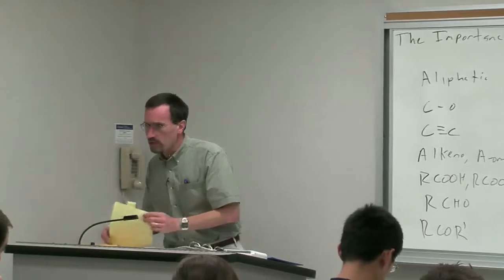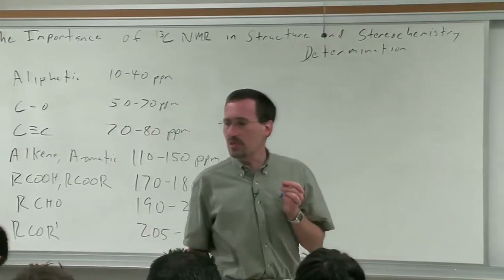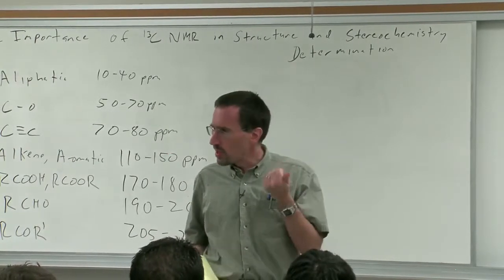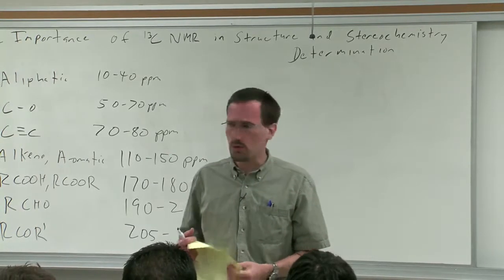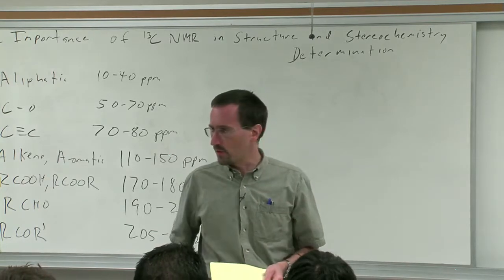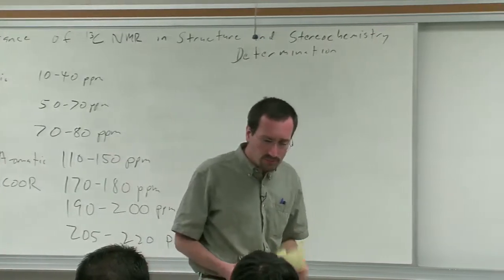Along with this richness comes tremendous power, because carbon NMR can give you tons of rich information about structure, and can be really useful for figuring out, confirming, and disproving structures. At the end I'll show you a beautiful example of some fraudulent work that was disproven by Professor Rachnovsky's laboratory, and a tool that can get you a lot more information than meets the eye.